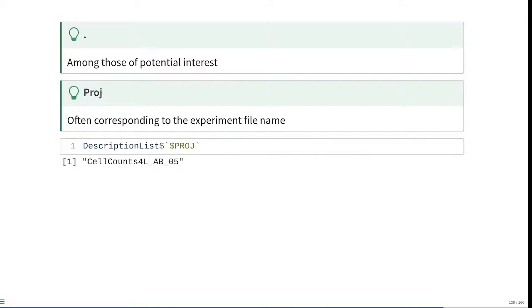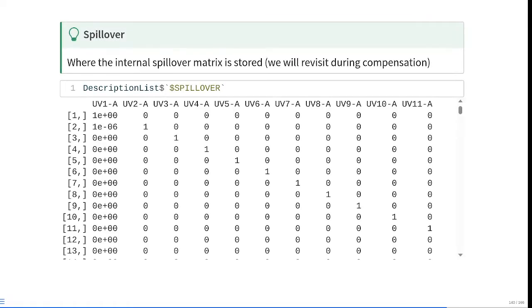And this was just the big description for these, being able to access it. You're still using dollar signs. Also remember, if you're using a dollar sign, that's a special character in R. So you have to include tick marks around it in order for it not to be interpreted as a particular type of command. Same thing happens if you have spaces in a particular keyword name. You'd have to include the little tick marks just so it's included as a single character value when it's being searched for. In my case, I downsampled this file, so there were only 100 cells being listed.